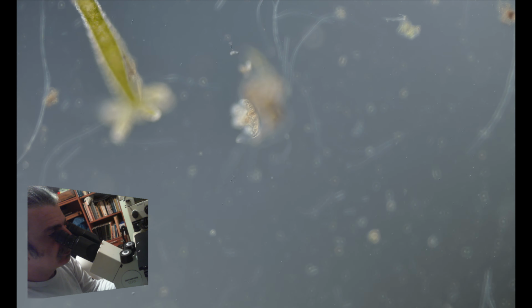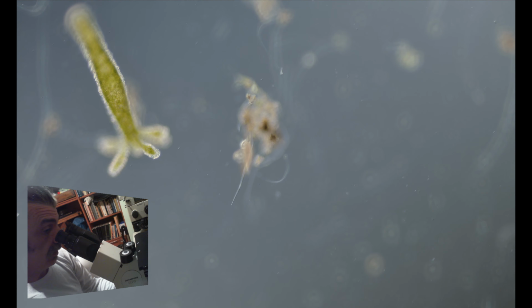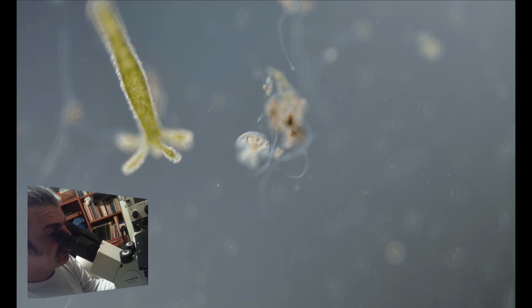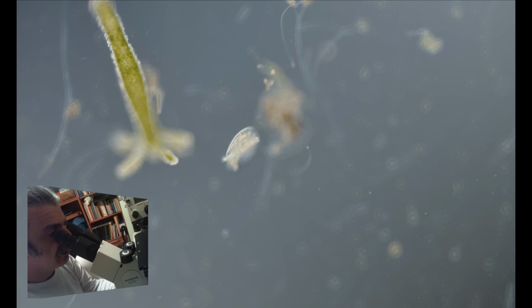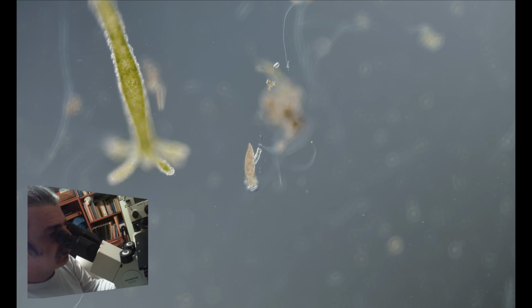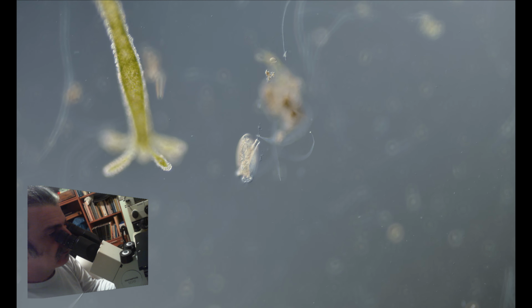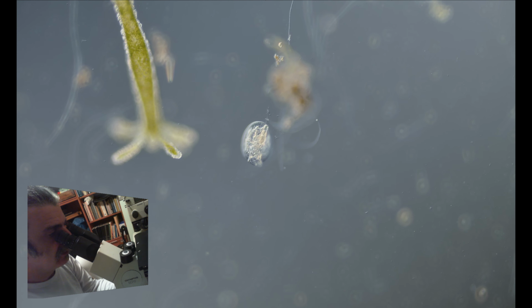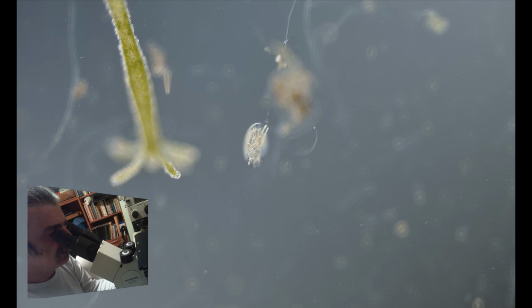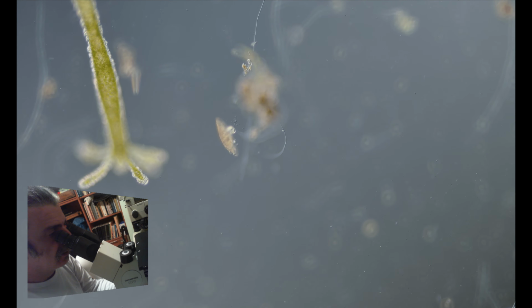With that, that's the Testudinella. It's a rotifer. Always reminds me of the Starship Enterprise. You can see it now from the side. It has a toe beneath it, and it's like a flat disc that hovers around.